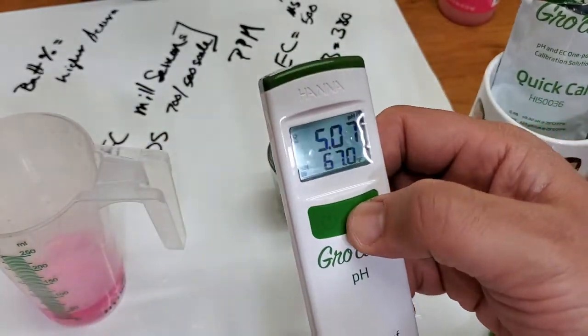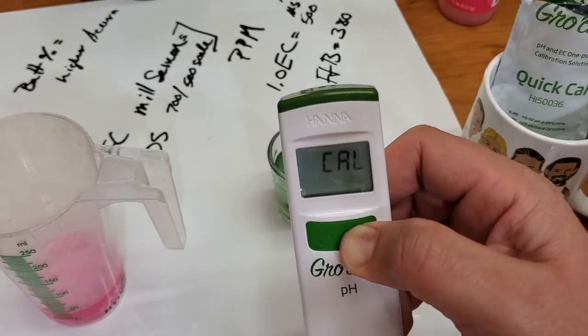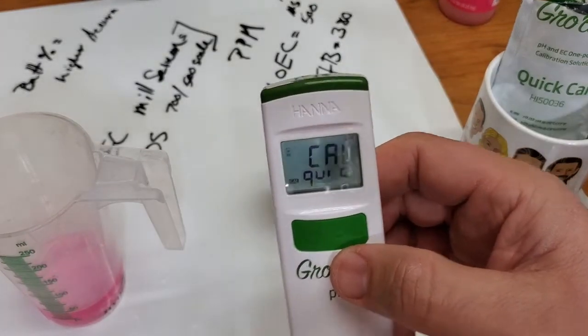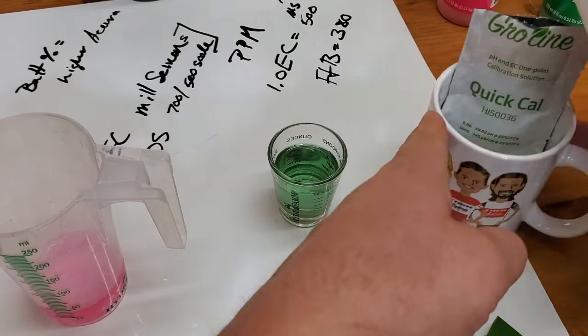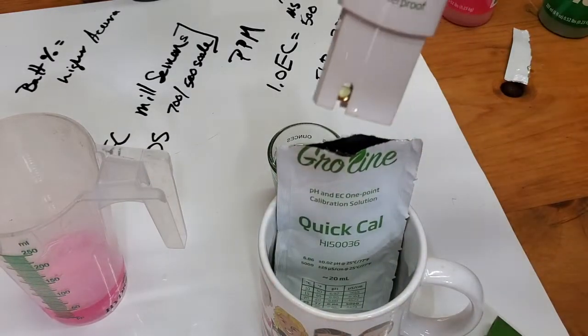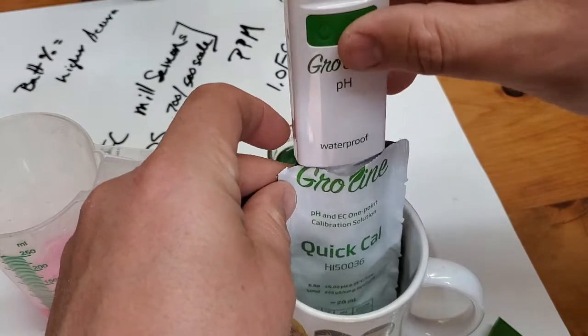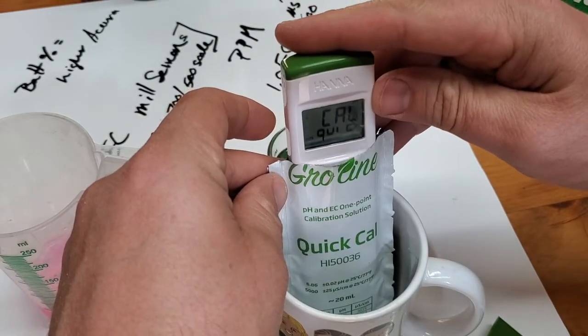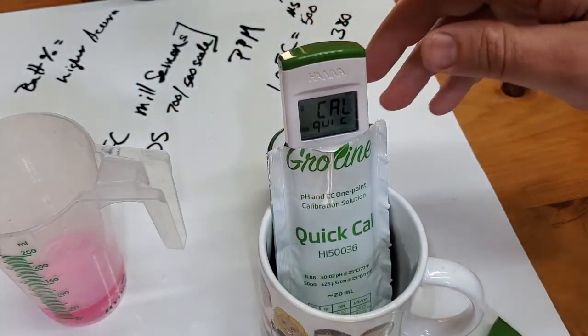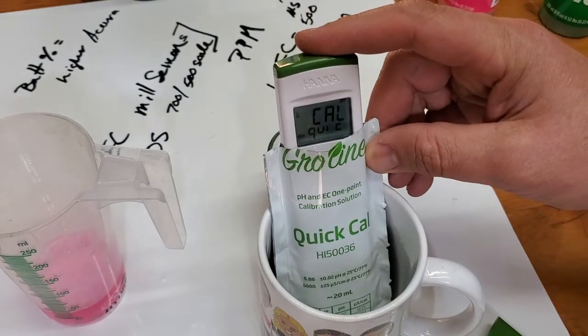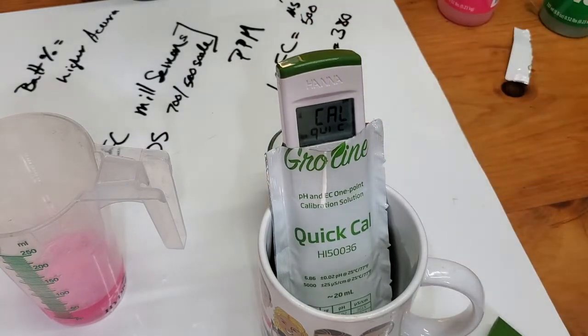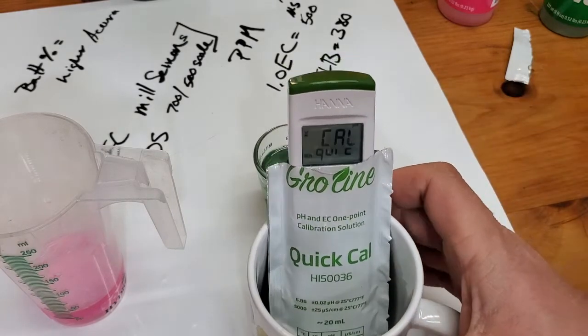We're just gonna hold down Cal and it's saying Quick Cal. So I've got my bag of Quick Cal still out here from 9814 demonstration. I'm just gonna throw that joker down in there and it's calibrating.